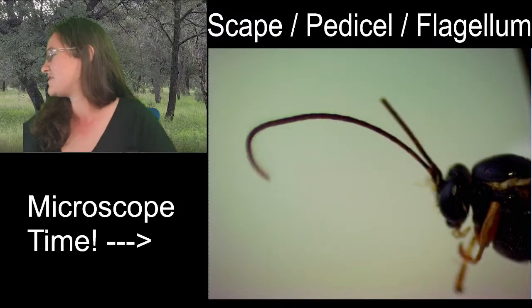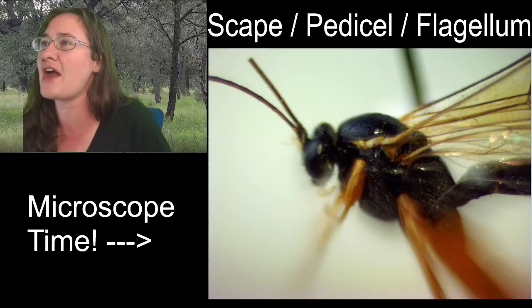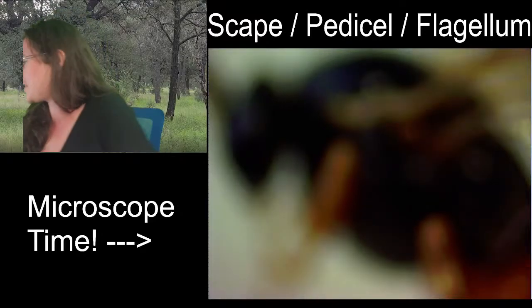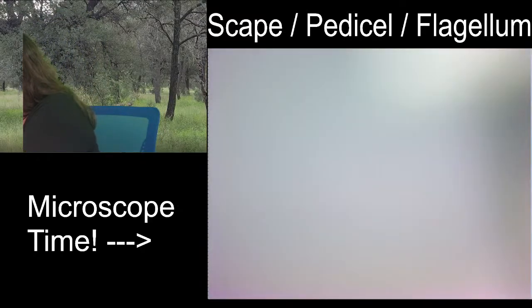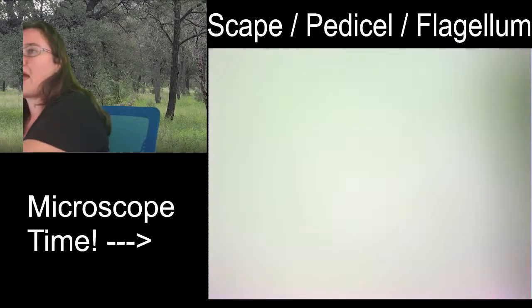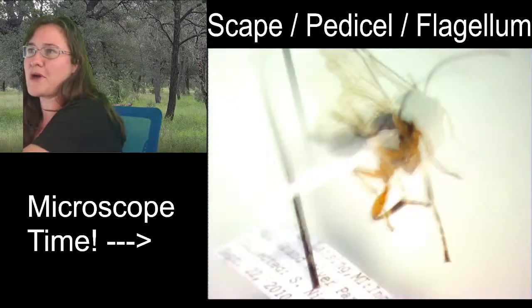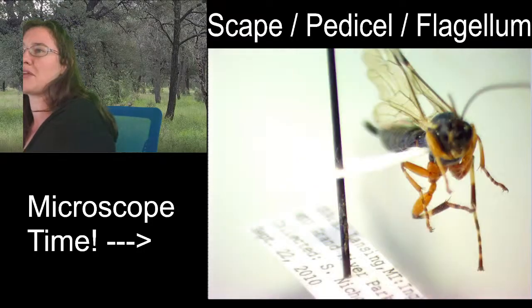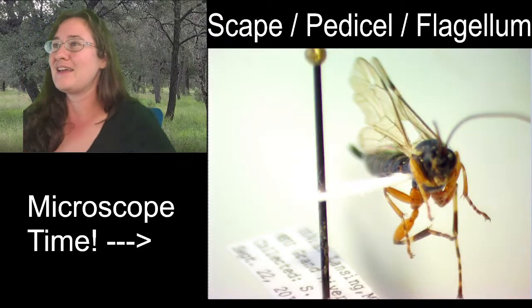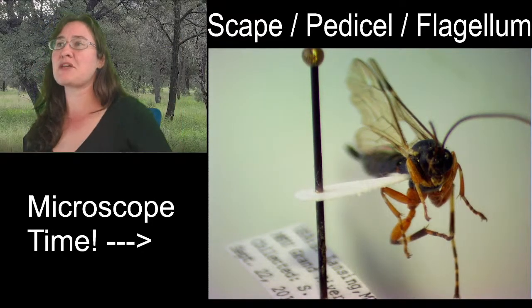All right, now it's time to zoom in on those mouth parts and see if we can see anything fun there. I personally would like to look at our friend head on. And I think that's going to be easier for us to see the mouth parts, too. Oh, and this is a really good angle to show you what I mean by pointing. This is what a pointed specimen looks like.